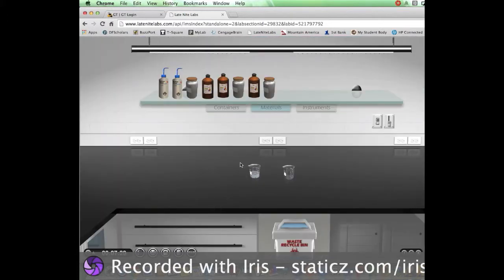It's always important to put away your materials. Where's that recycling bin at? Down here. Oh, okay. Why's the waste? Just put it in there. I'll just clean that up. There we go. Always want to make sure your lab space is tidy and not leave anything out. And we are ready to go. Ready to do some calculations.